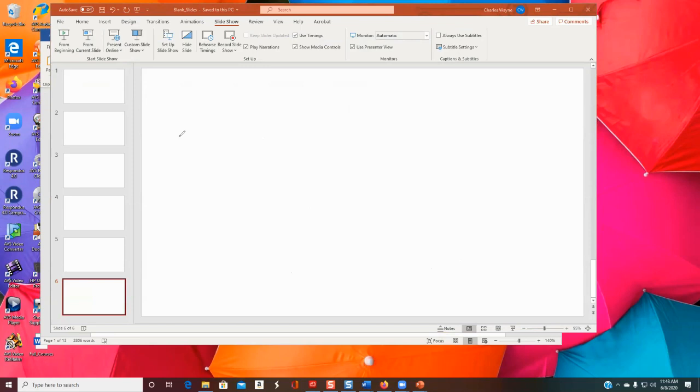Sometimes we use the letter D and we say distance equals 1.22 times lambda over 2 NA. That's the formula. And yes, you should know the formula for the test because the performance objective says you should be able to calculate this.